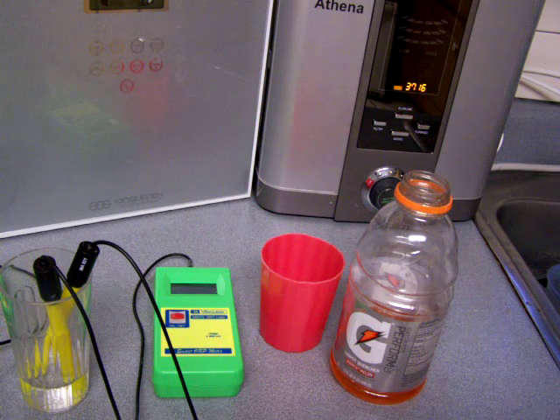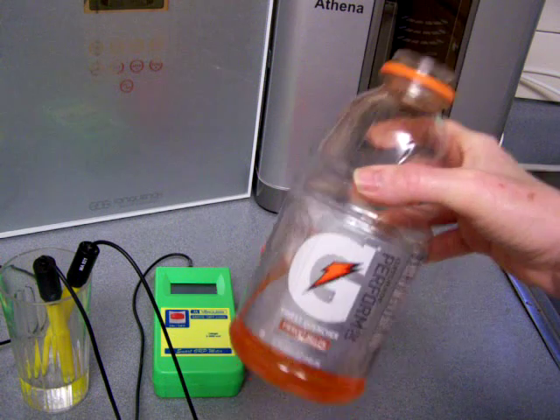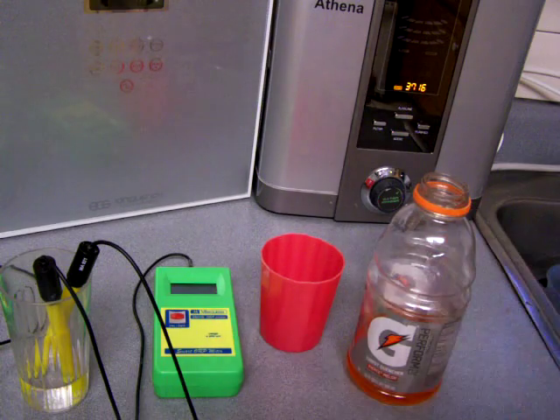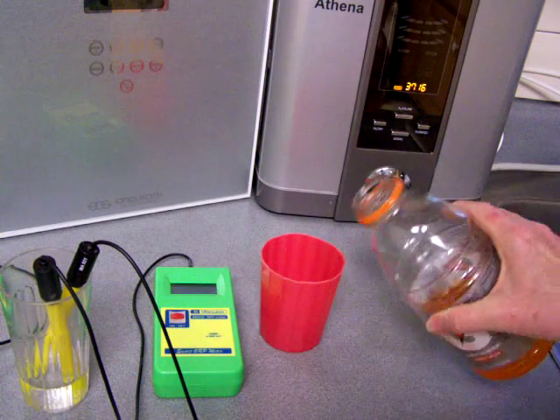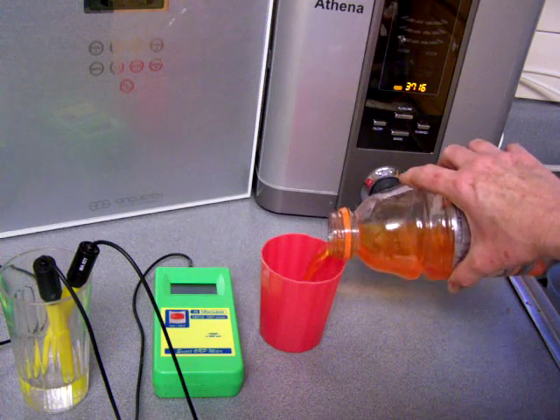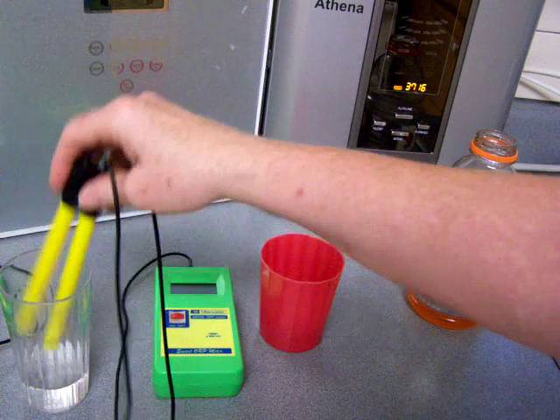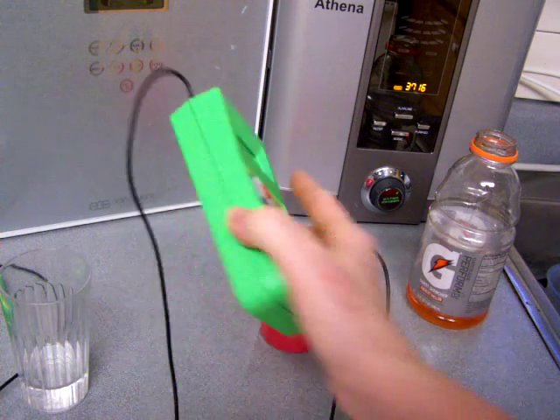Out of curiosity, I'm going to test Gatorade — the orange-flavored one — for both acidity and ORP, just to see what it is. I've done lots of tests for ionized water, and this will just let us know. I'm going to put both probes in and then we'll just take a look.